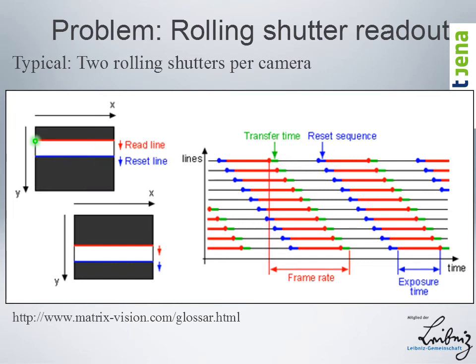And when a pixel reaches the red line, it stops the integration and reads out the data. The timing diagrams are shown here. But of course, that's bad because we want to illuminate the whole thing, and that makes it really slow, because we would first have the reset line going through, then integrate, and then the read line, and we are losing lots of time. So we came up with some strategies of how to illuminate different parts of your image with different patterns at the same time. And you can see this in the next animation.